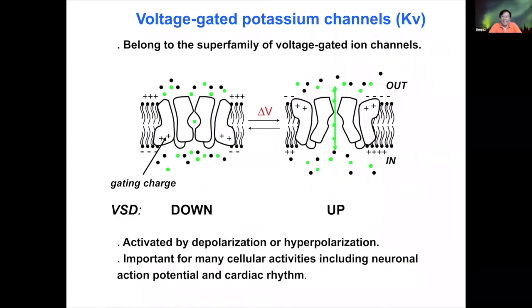Inside the cell, there is about 100 to 150 millimolar potassium chloride, and there are also 2 to 3 millimolar magnesium chloride, and a very low concentration of calcium, of course. So it's very close to the high salt condition we used. The low salt condition we used is usually below 50 millimolar.